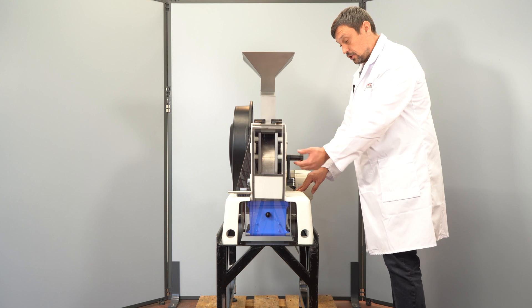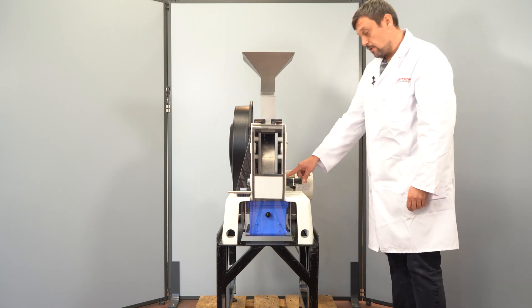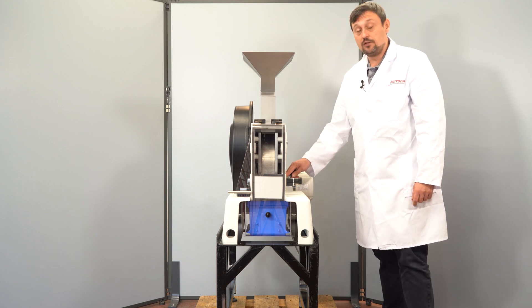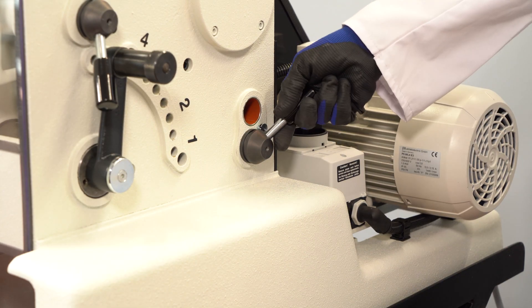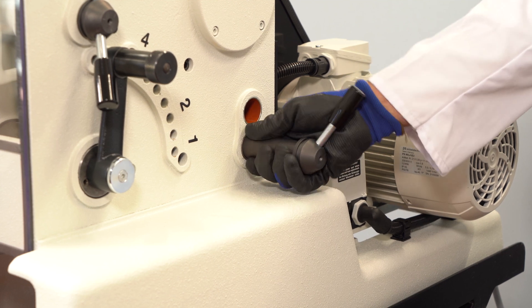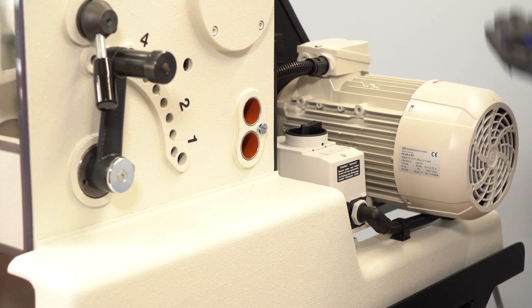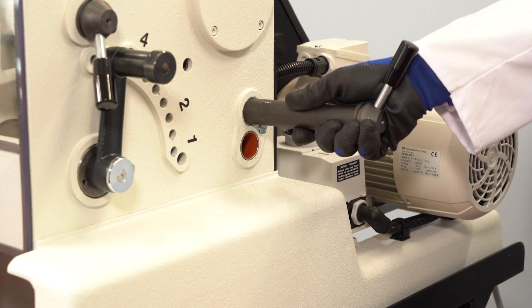We have here the adjustment for the gaps, and we also have the possibility to change the grinding geometry. To change the grinding geometry for special samples like coal or other fatty sticky samples, you have to remove this security stick and move it by hand into the right position. Now you can secure the position again.